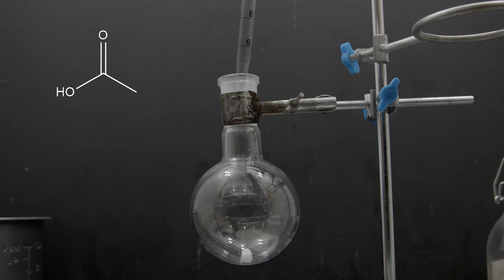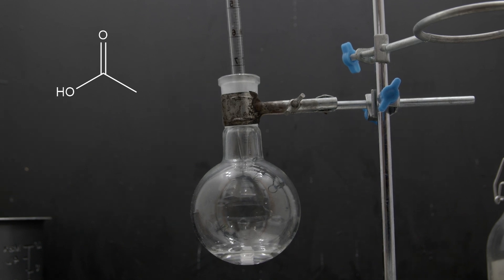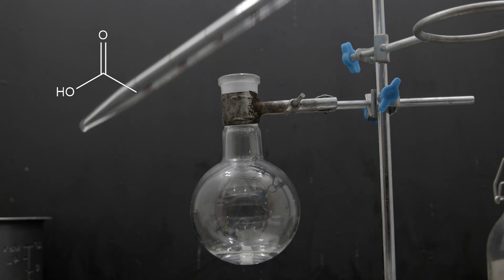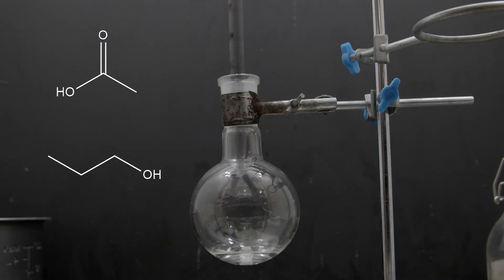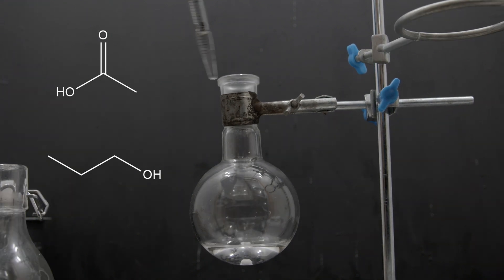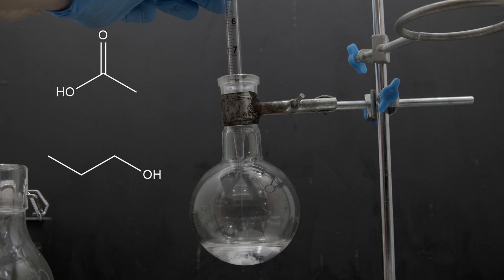So to a round bottom flask, we slowly add 10 milliliters of glacial acetic acid that we extracted from vinegar, and then we followed up with 12 milliliters of propanol. This I bought as a hand sanitizer additive, and we finish it off with a nice little dash of sulfuric acid.